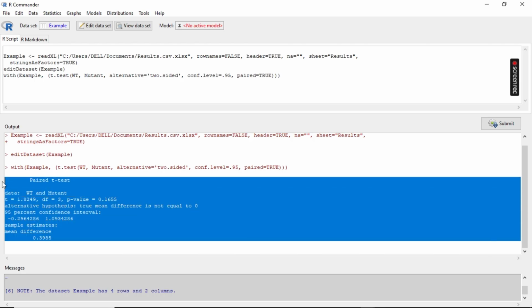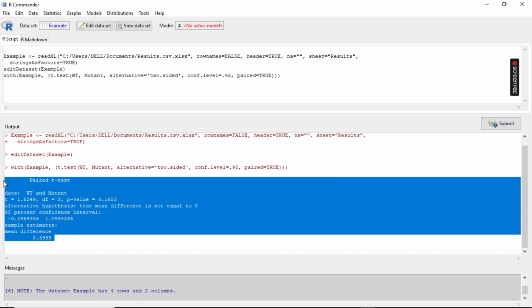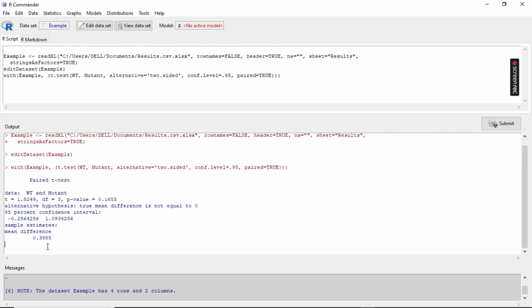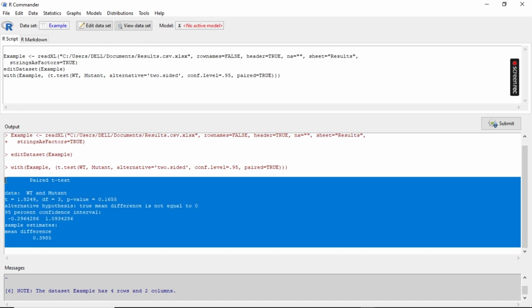So this is how I make simple phenotyping analysis, and how I would interpret these results. This is very subjective and very dependent on each project you are working with. What are you comparing between plants? So in this case, I can just say that there is no significant difference between my wild type and the mutant in terms of leaf length in centimeters.